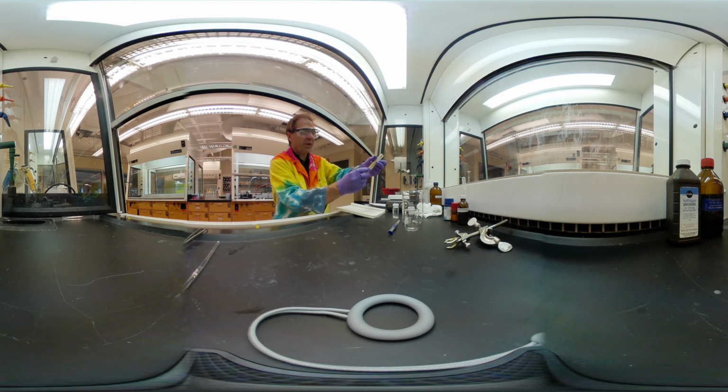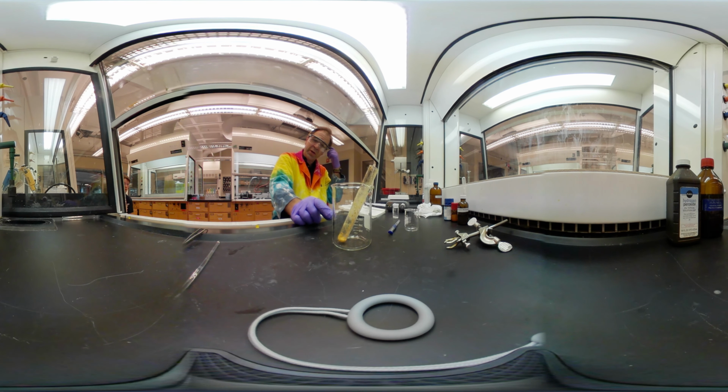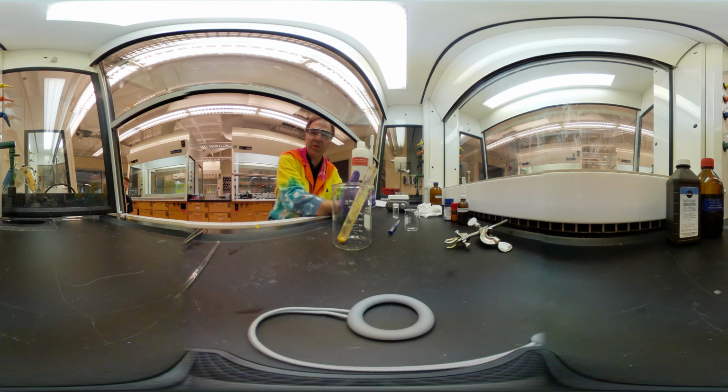Okay, so here is our material. I'm going to set it in this so you can see it. So now we've made intermediate 2. We need to convert it into the final luminol here. So we need some sodium hydroxide. This is 10% sodium hydroxide. This is really nasty stuff. This is like Drano.